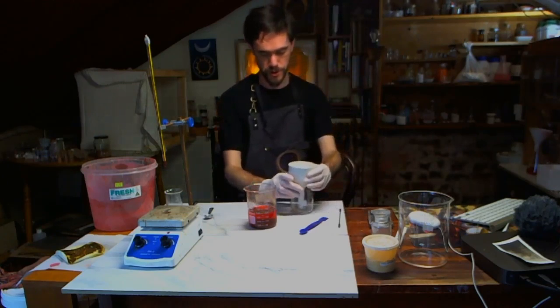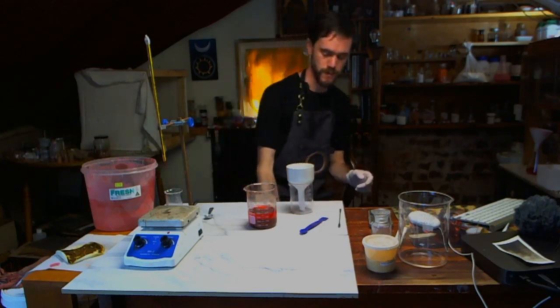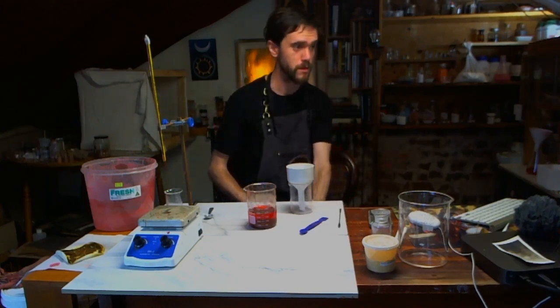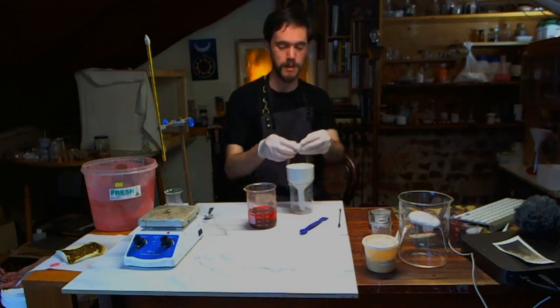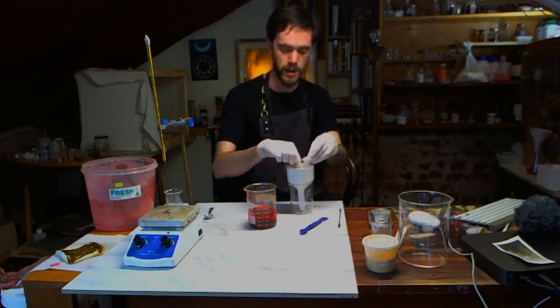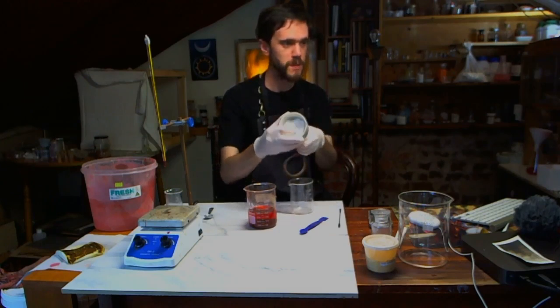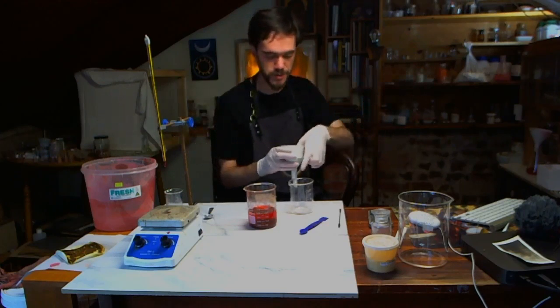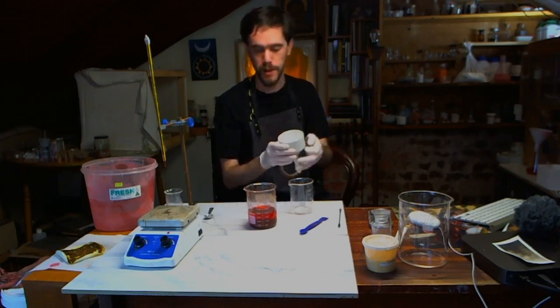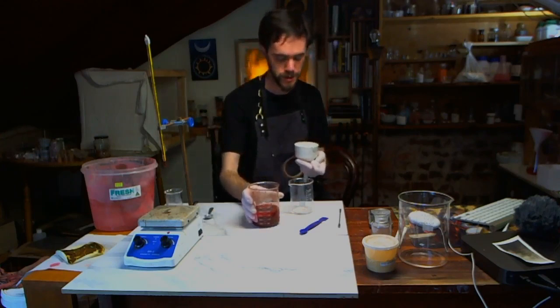What I think I'll do is, paper chromatography isn't that fancy, you're right. And I've been thinking about getting some stuff to do it. So I'm just making a bed of cotton wool in here, just because I seem to be using all of my filters and things. And we're just going to pour this liquid through because we don't want the plant material anymore, we just want the liquid.